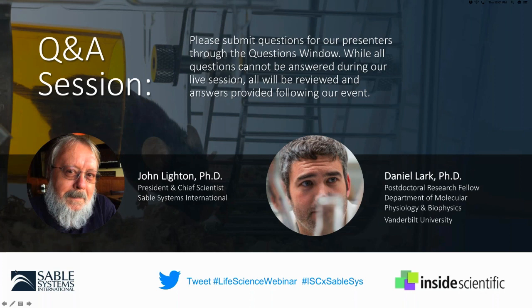Okay. And Dan, a couple of questions for you. Can you detect the acute contribution of voluntary wheel running to energy expenditure like you showed for off-wheel activity? So the answer is absolutely yes. That's actually the easier one to measure, and people have already shown previously that you can detect the contribution of wheel running to total daily energy expenditure. But yes, we can do the same thing that I showed with off-wheel activity, these 5-minute increments. We actually see the same thing with wheel running, and in fact, some of the data that I didn't show is that the efficiency of wheel running, so the energy expenditure per meter traveled, is actually a pretty strong predictor of overall distance. And so not only can we do that, but you can also start digging into relationships between the behavior and the energy expenditure during wheel running, just like we did for off-wheel activity.